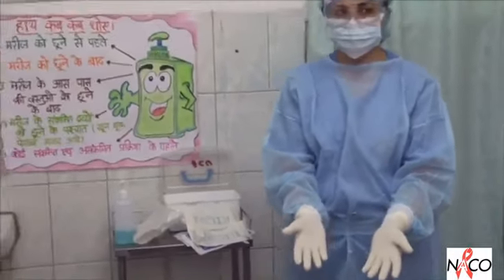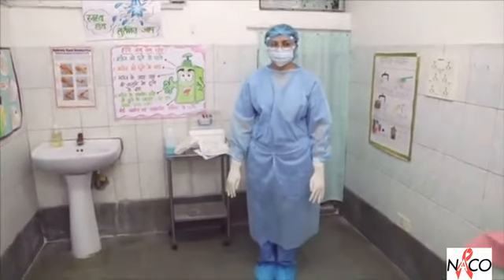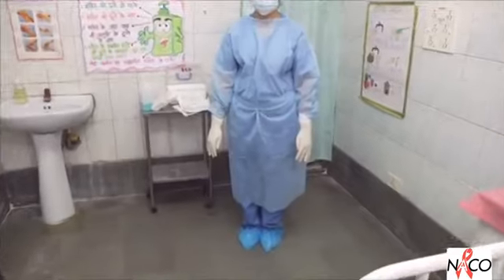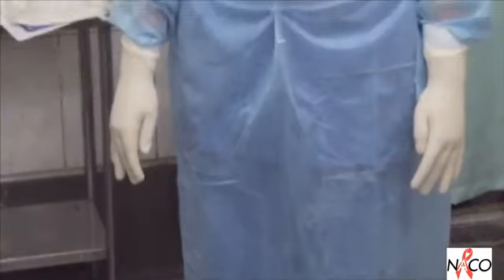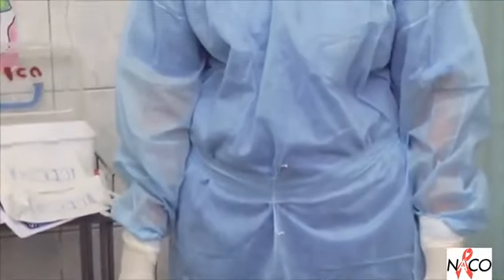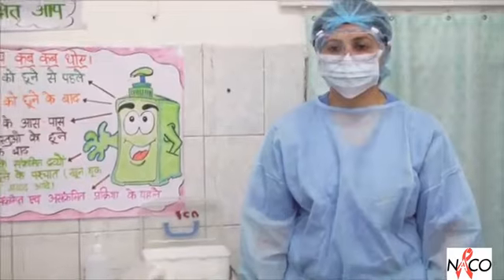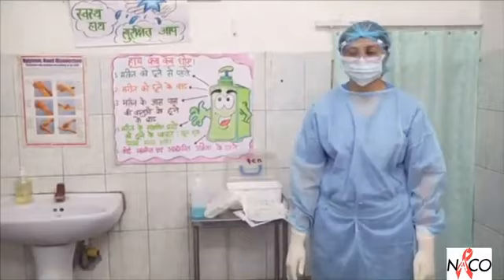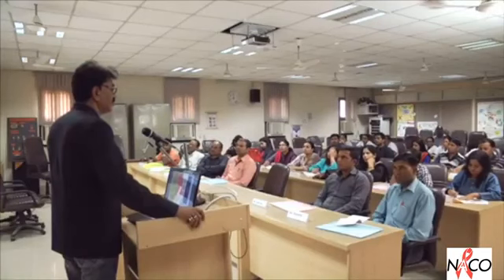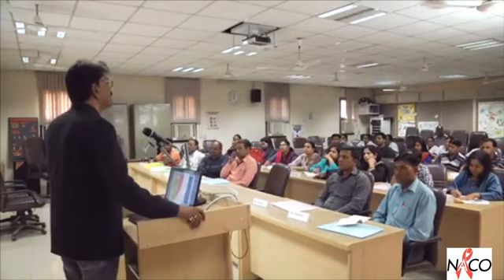2. Avoid any contact between contaminated PPE and surfaces, clothing, or people outside the patient care area. 3. Do not share personal protective equipment. 4. Change personal protective equipment completely and thoroughly wash hands each time you leave a patient to attend another patient or another duty. 5. Follow hand hygiene. 6. Use of personal protective equipment does not replace other infection control measures. Continuous availability of personal protective equipment and adequate training for its proper use are essential.